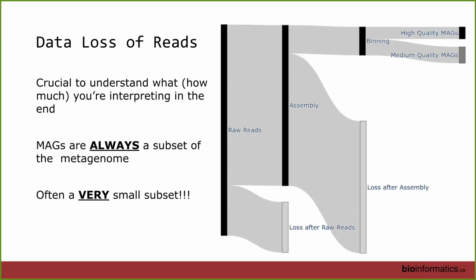Now, I would like to say that these are totally crappy samples and you're never going to see this. Generally speaking, this is what you're going to see. MAGs are going to make up a very small amount of your actual metagenomic data.